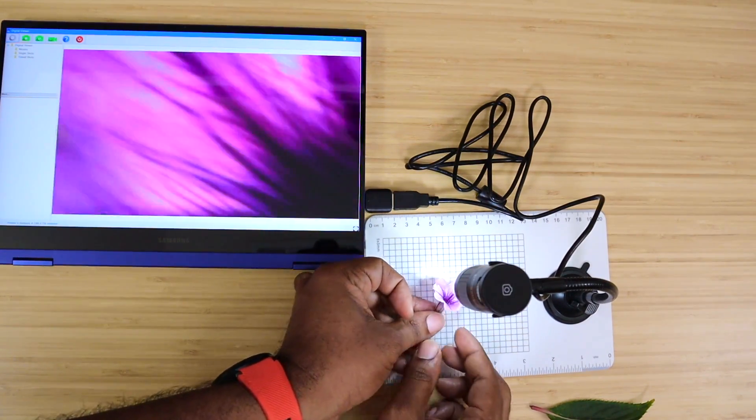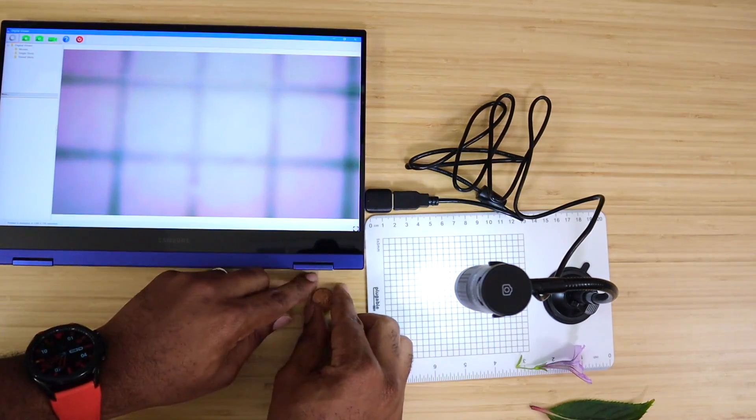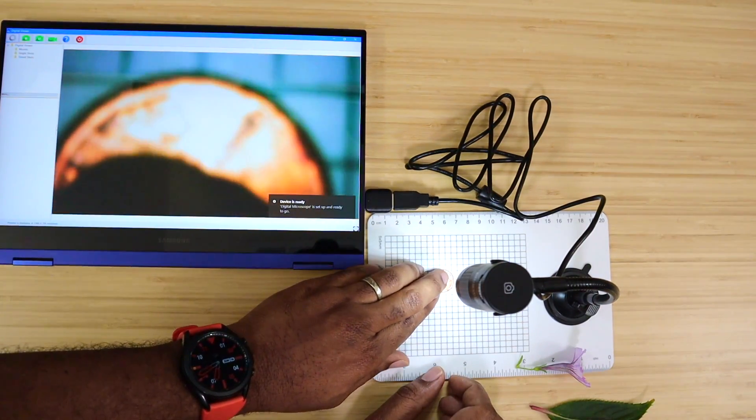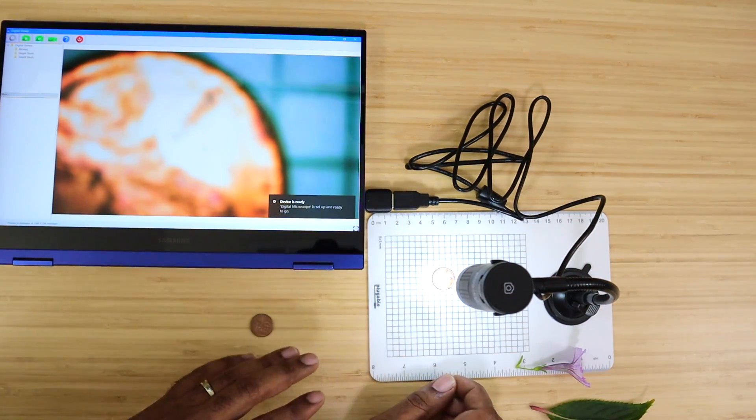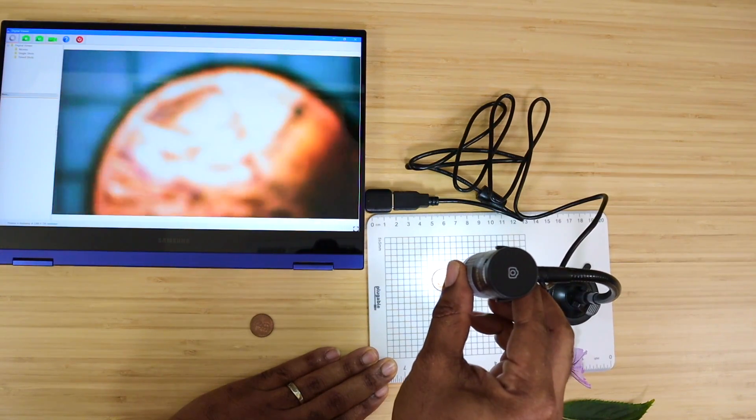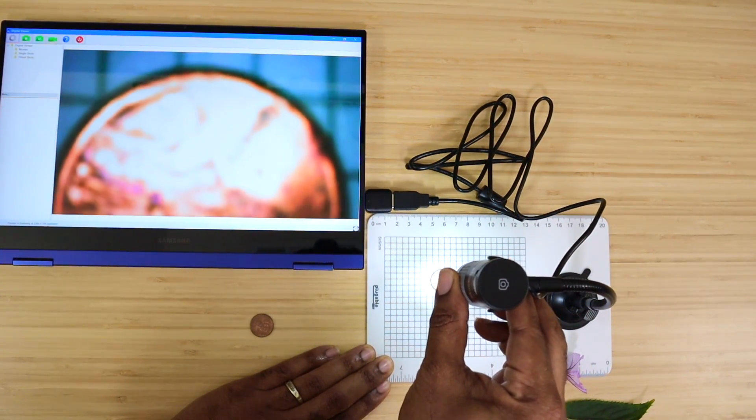It's a great device for you to have for your kids, especially with them going back to school and doing everything from home. It's a great device to have. Now let's check out this penny.